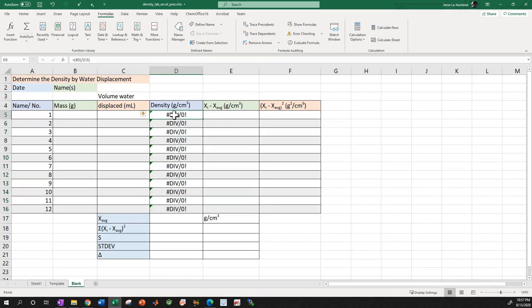Oh shoot, see? This is a perfect learning moment. I thought I told Excel to do something and it didn't. Let's see what happened. Well, it didn't ruin any of my equations. Those are all the same. Let me go back to the cell. See what I did. Average, okay, there we go. Maybe I didn't have it highlighted. Teachable moment. So it's asking you, well, what do you want to average, dude?